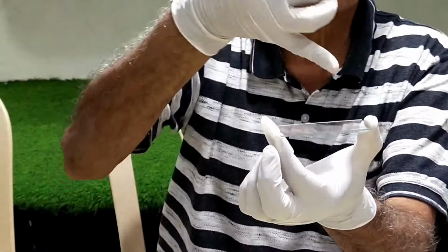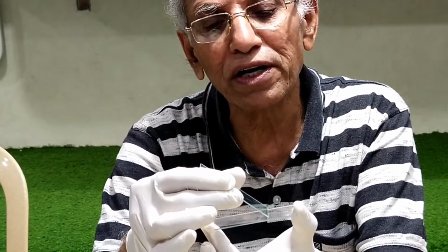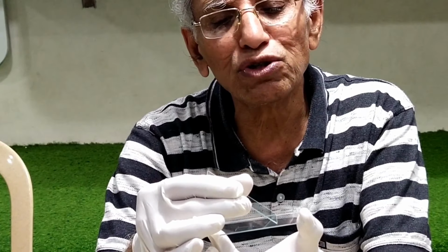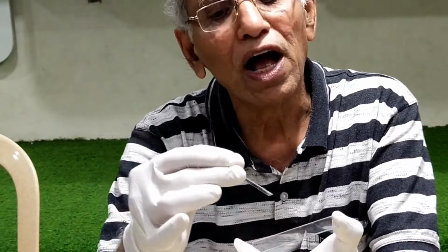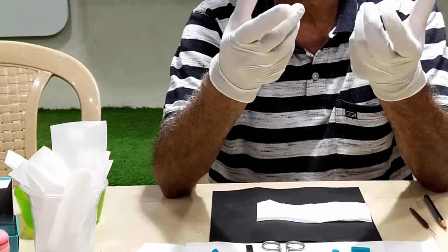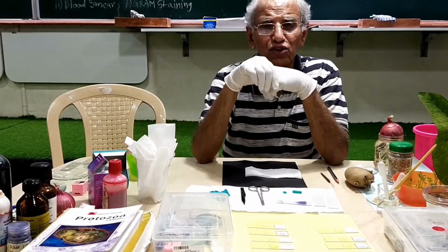I'll repeat. A drop of blood is taken here, a tiny drop of blood, not very big. Then a few millimeters behind the drop of blood, I'm just holding the edge of the spreader. And then I'm just moving it to the blood drop. And then quickly, with enough pressure, I'm just only once moving it backward. And the blood will be spread. Interestingly, the blood smear gets dried within a few minutes, and then it can be directly observed under a microscope. You don't require any kind of cover glass to be put in.